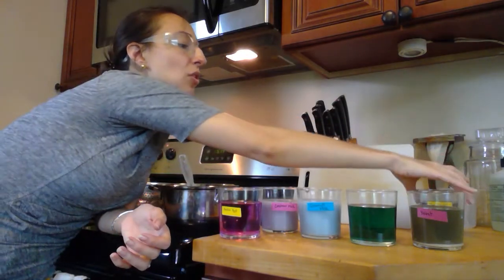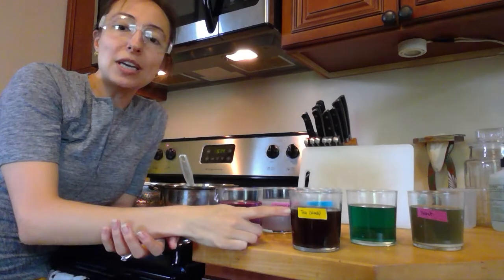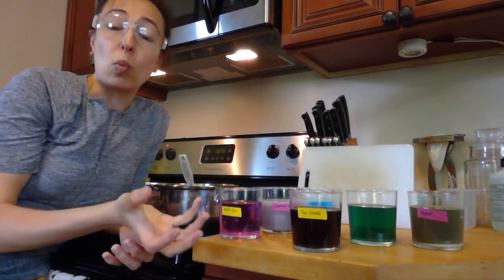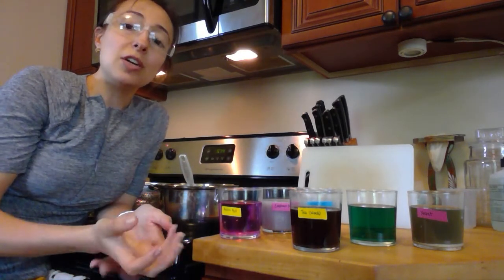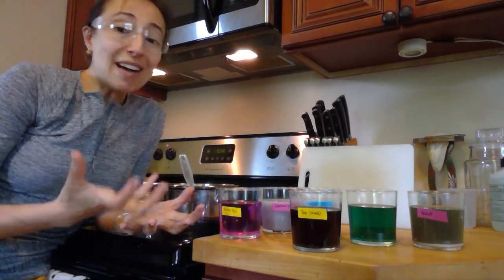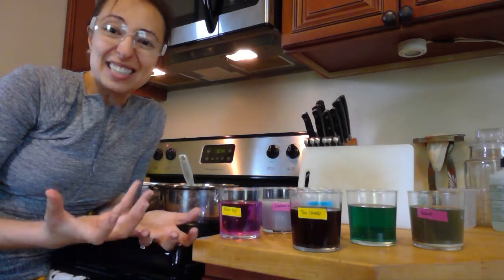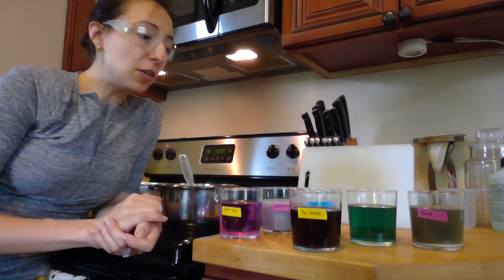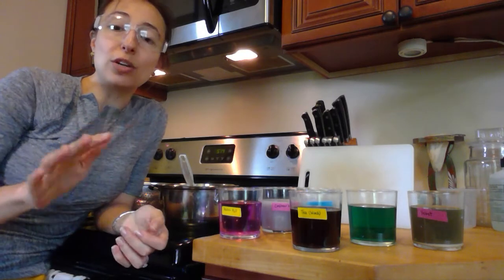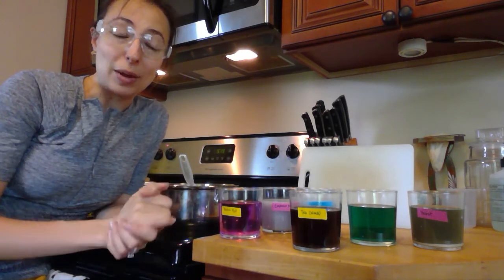And if you get some murky results, that's okay. Test it out again. Maybe you take a little bit of this and dilute it with more water so the color is more clear and easier to see when you add your indicator to it. As always, have fun with it. Grab things that you don't know what they're going to turn into and test it out. And once you're finished, make sure to take pictures so you can include them in your lab analysis for your homework before you throw anything away.